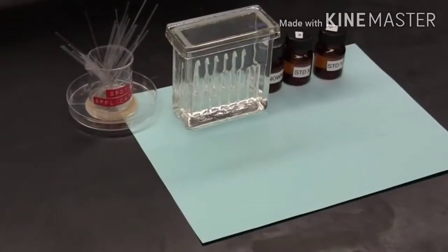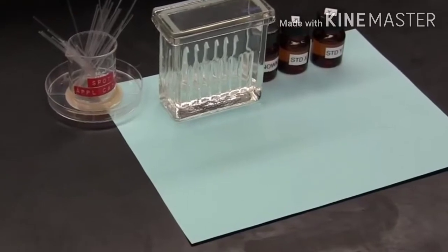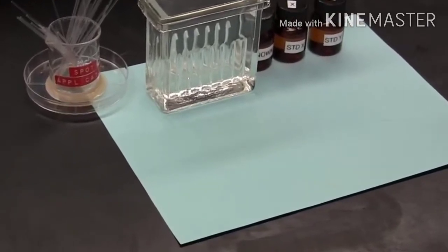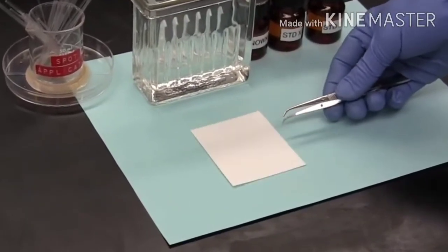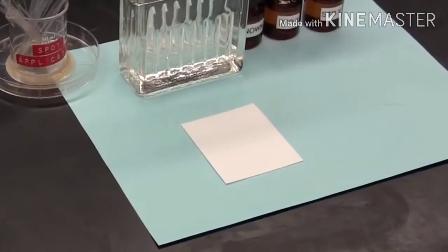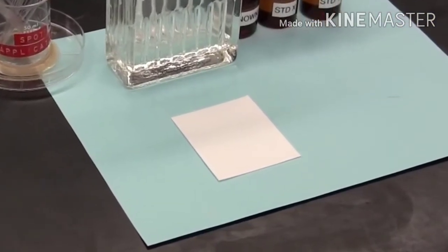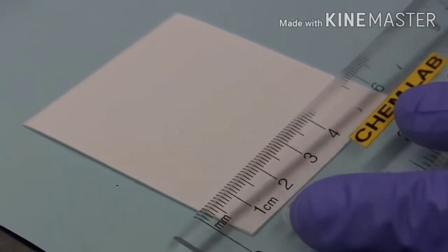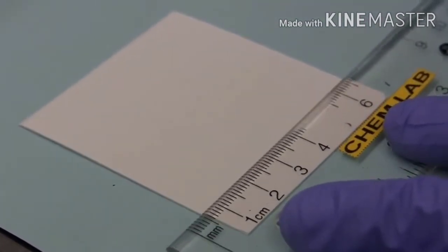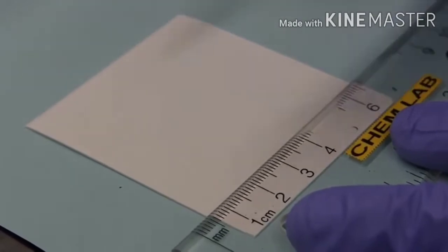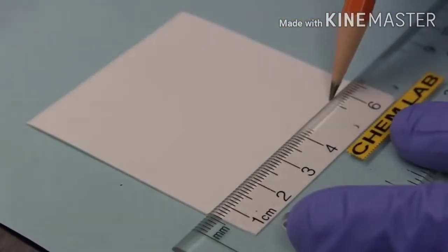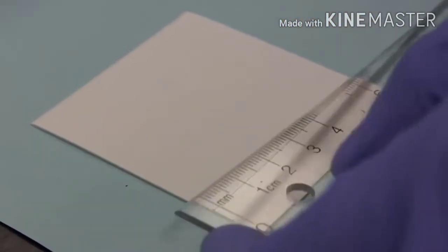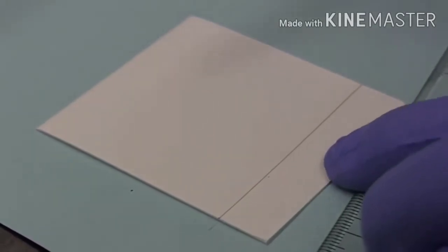Let's take a closer look. First of all, we need to prepare the TLC plate. Make sure that you handle it only by its edges or use tweezers since we don't want to contaminate the silica gel surface. A ruler is used to draw a line using a pencil about a centimeter from the bottom edge of the plate. Draw only a very light line and try not to score the surface of the silica. This line is called the origin.